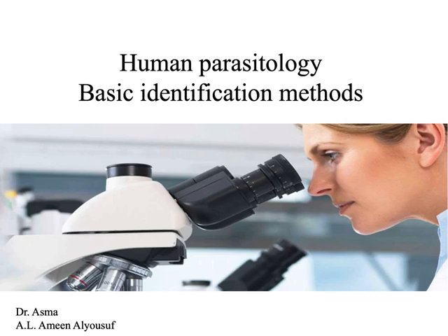The last lecture and the last class of human parasitology will be the basic identification methods. How can we identify and diagnose the specimens, and how many types and techniques do we have?